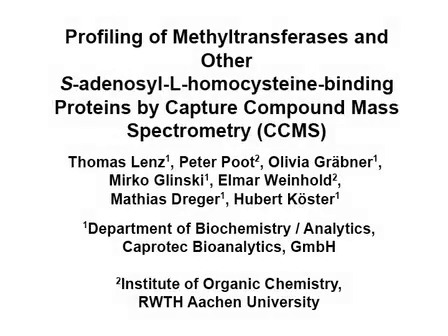The overall goal of the following experiment is to profile methyltransferases from complex protein mixtures by capture compound mass spectrometry, or CCMS. The methyltransferases are functionally isolated by trifunctional capture compounds that carry the general methyltransferase product inhibitor S-adenosyl-L-homocysteine, short SAH, as the selectivity function.